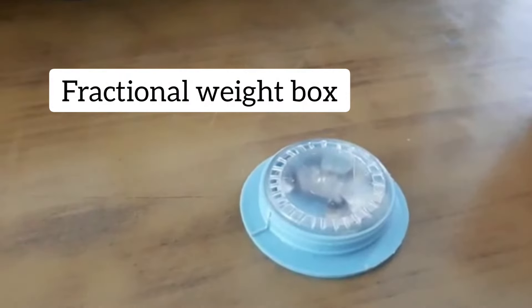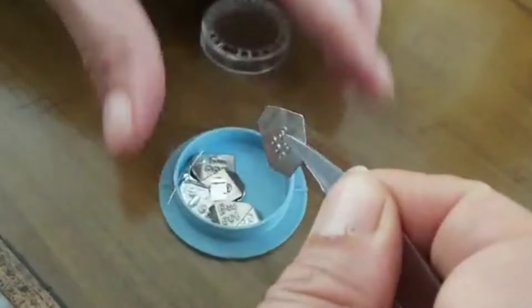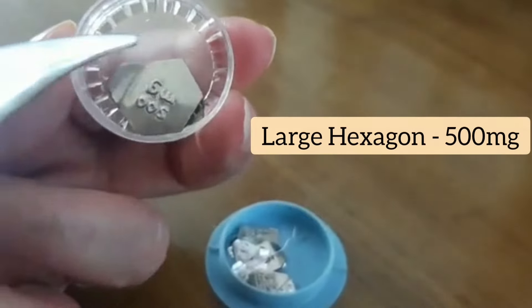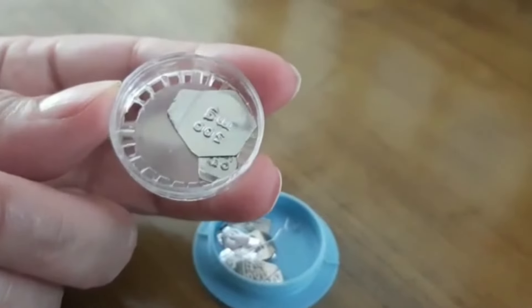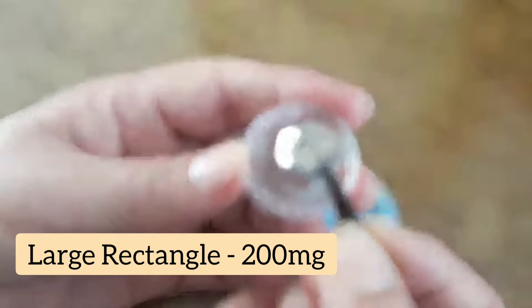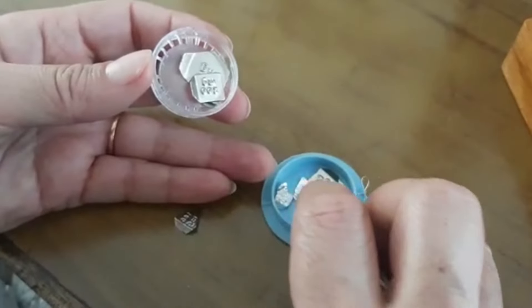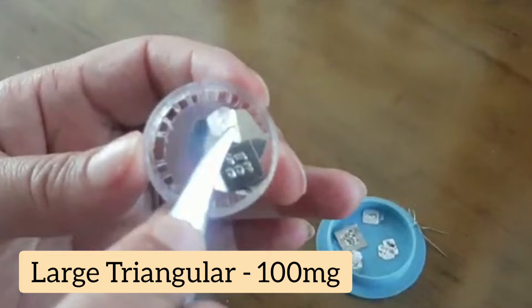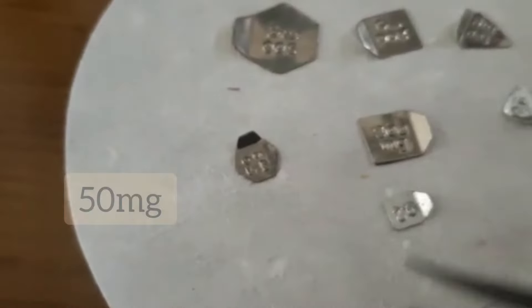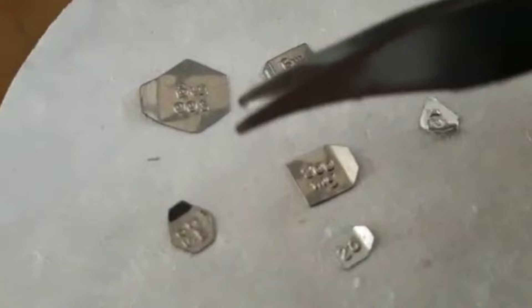This is the fractional weight box. In it we have different shapes of weights — a hexagonal shape is 500 milligrams, and different shapes help you identify them more easily. There is a rectangular 200 milligram weight and a triangular 100 milligram weight. A smaller hexagon is 50 milligrams. The original weight box had weights in grams; this fractional weight box has weights in milligrams.